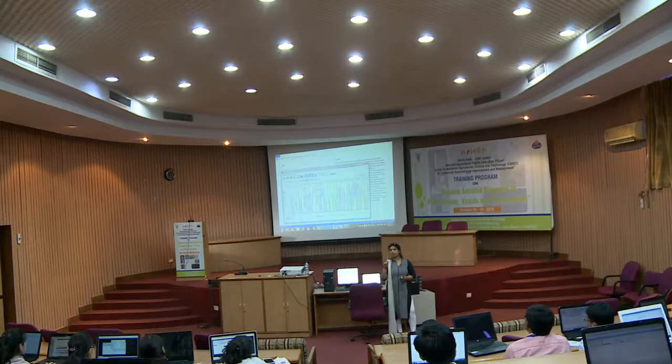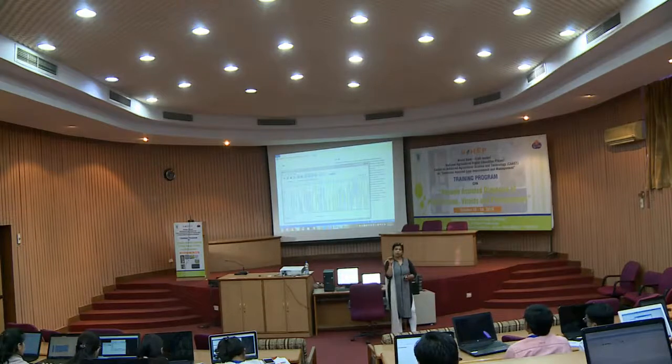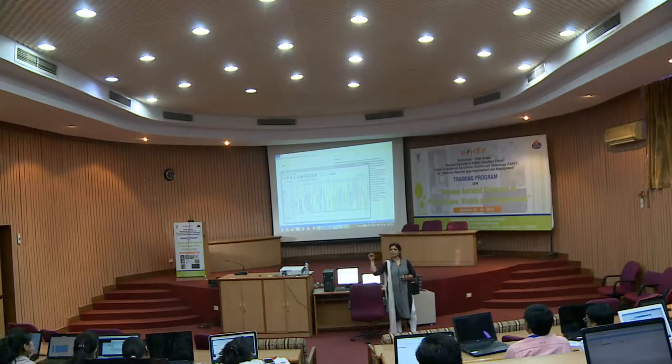But whether I have to go with that or not, I have to go back to my chromatogram file and check that particular base. If the quality value of that base is more than 20 or 25, then I can say that it has misread that C as A in the reverse sequence.